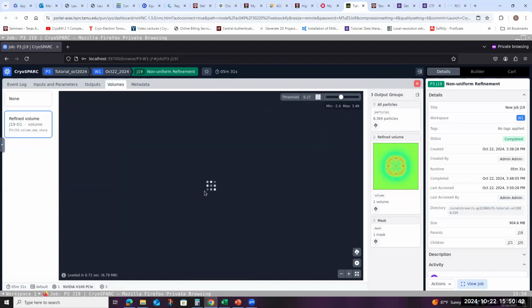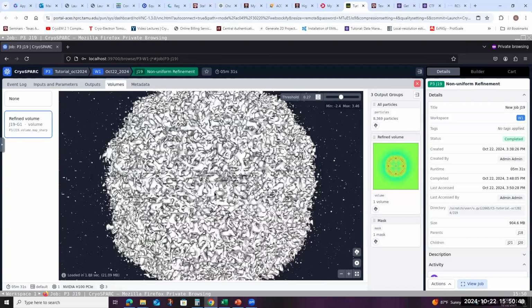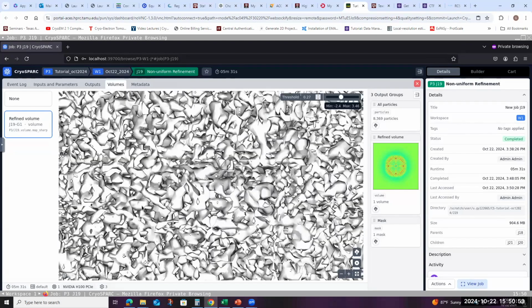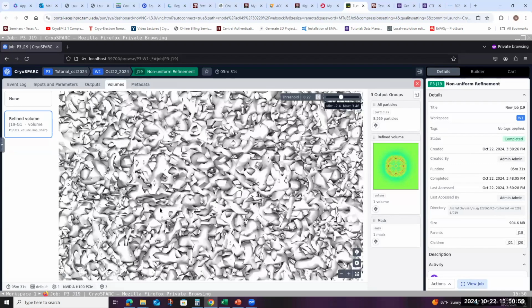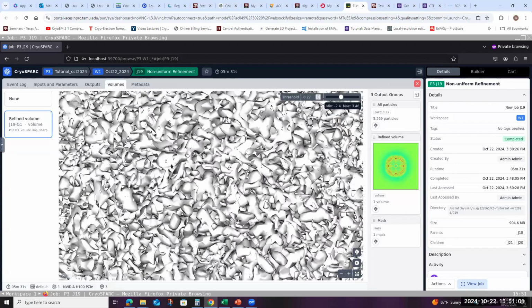So we go to the lower pixel size, and then we reprocess. Even at this resolution, if you pay attention properly, you can see the heavy side chains, or you can say aromatic side chains. They're already taking shape. You can see them here.